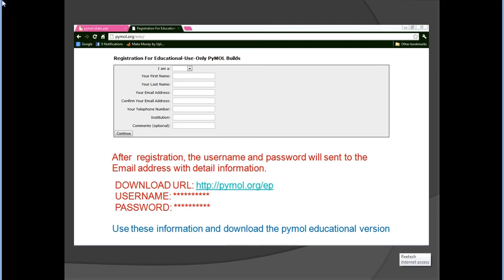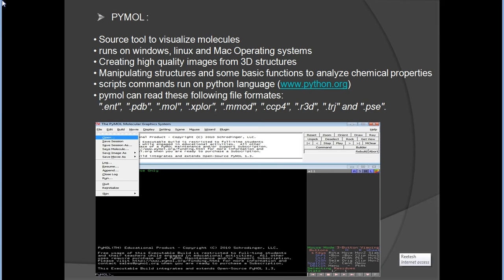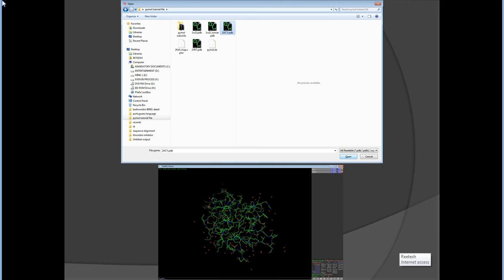PyMOL is a molecule visualization tool. It can run on Windows, Linux, and Mac operating systems. It supports many formats for visualization, but today I am here to describe how to visualize a protein molecule, which can be downloaded from the Protein Data Bank in PDB format.